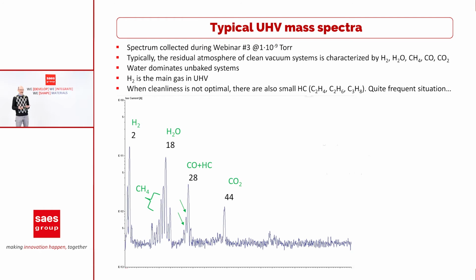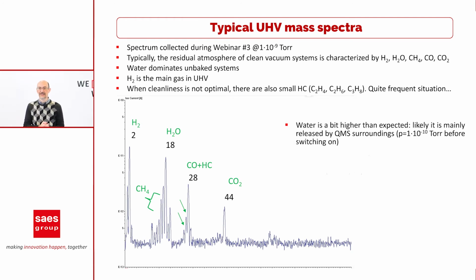What can we say about this spectrum? Water is a bit higher than expected. Likely it is mainly released by the QMS surroundings. Indeed, the pressure was 10 to the minus 10 torr before switching on the QMS.